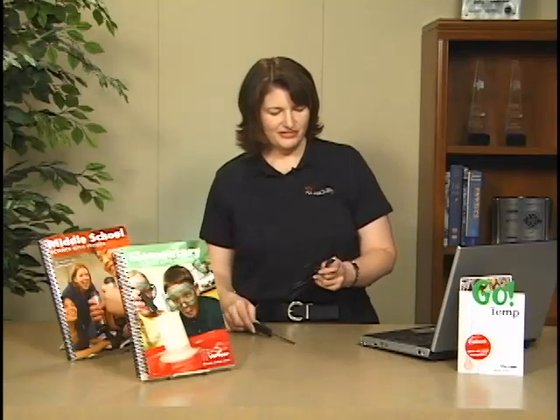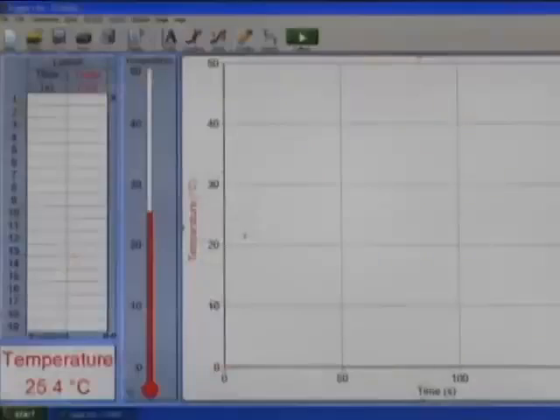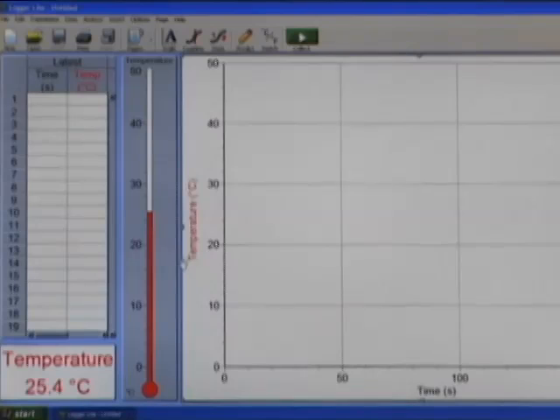When you use the GoTemp, you're going to plug it into your computer's USB port, launch the Logger Lite software, and you'll automatically see a graph, a data table, a thermometer meter, and a digital meter all on your computer screen so students can see all the different ways that you can represent temperature.